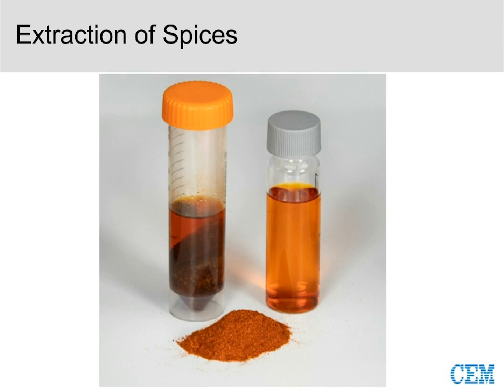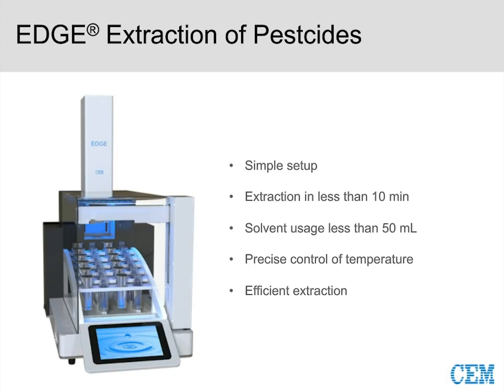So with that, I'm going to dig in a little bit deeper into the EDGE method. So from a broad perspective, the EDGE is simple in setup, and I'm going to walk you through everything from start to finish, because I want you to be able to refer back to these slides and run exactly what I've told you about, and realize the simplicity of running the EDGE, even from this presentation alone. So we'll get into details on that. And then the extraction, like I said, in this case for the pesticides, we're doing a 7-minute run, so less than 10 minutes there.